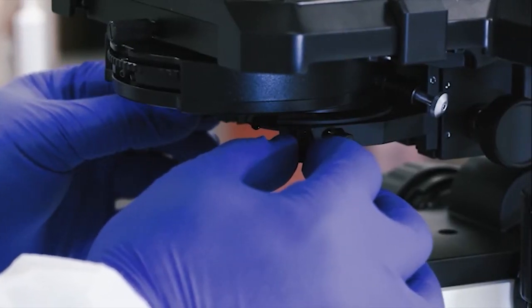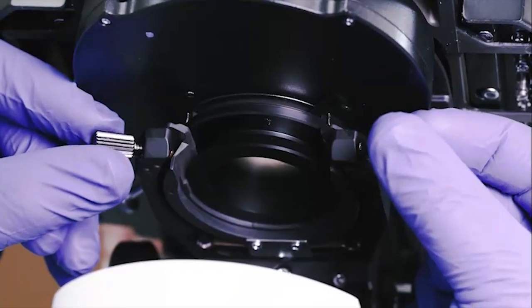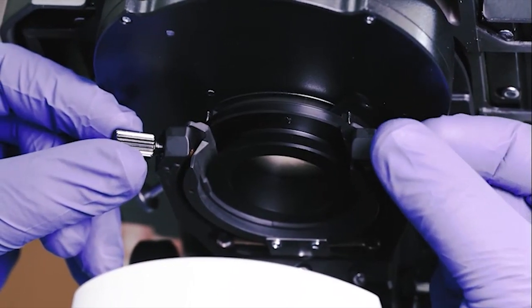Using the centering screws on the side of the condenser, center the edge of the circle of light in the center of the field of view.